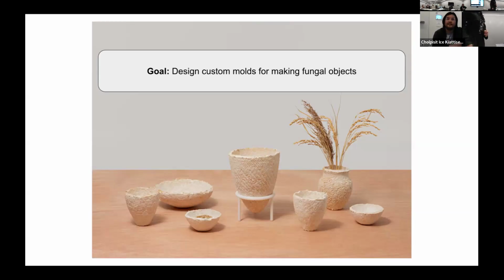Don't eat it. I will say don't eat it, but technically this is the reishi mushroom, which is a very common edible mushroom, though not cooked. These are all deactivated, they were baked at 200 degrees for a couple hours. But if you don't deactivate them, they will actually grow mushrooms. Whoa.